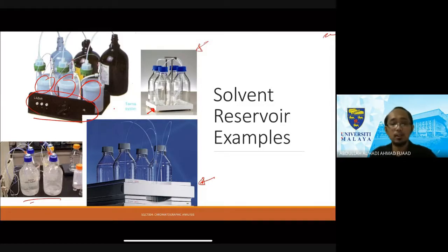Of course, to have the best practice in terms of chemical safety, these two are the best options. Why are these two not the best? Well, in chemical practice, especially in first world countries, normally in Australia, the UK, the US, the best practice is for each solvent container or solvent bottle to be put inside a solvent capture, or secondary containment, that's what they call it.